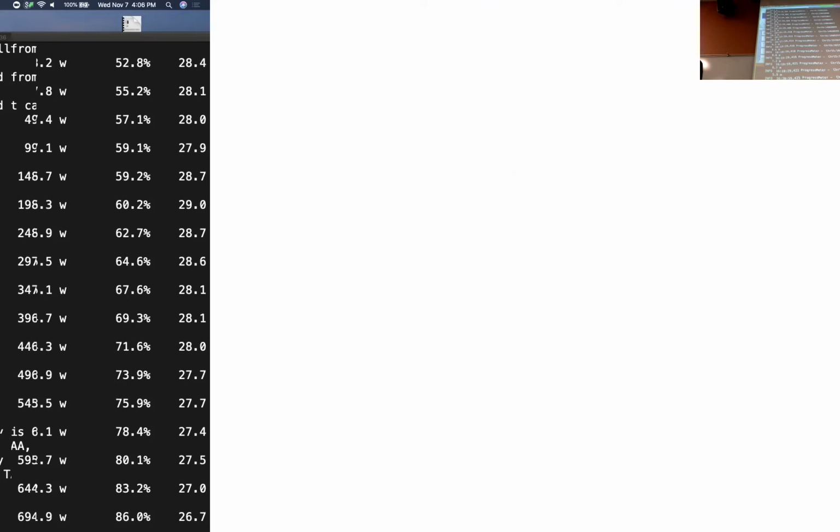So those are possible ways. And those are some of the things we've coded into the R script to systematically go into your genotype data and look for those biological features of your data and use that as a basis for filtering. So it's also going to use read depth to filter, right? So if you say, I want my SNPs to be at least 6, what the R script will do is map a genotype to the corresponding read depth. If the read depth is less than 6, it will turn it to missing, right?